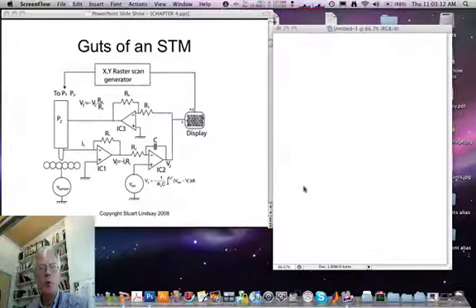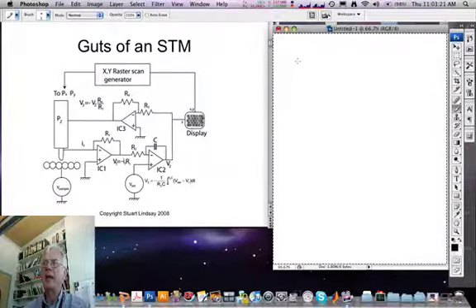In Module 4.1 we got a very quick overview of how a scanning tunneling microscope works. Let's look at it in more detail here. This figure shows a schematic electronic circuit for controlling a scanning tunneling microscope. Of course, these days it's all coded in digital control systems. But let's take a look at this circuit because we can understand some of the factors that go into controlling any scanning probe microscope. In order to understand this schematic, though, you need a little bit of electronics background.